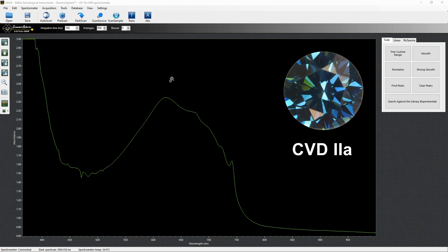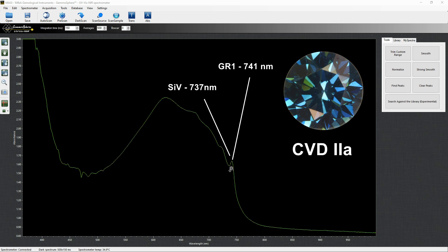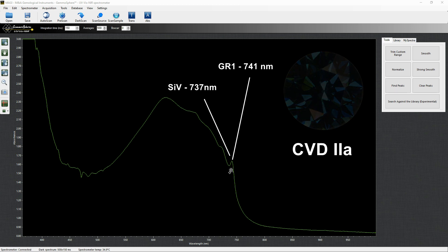CVD synthetic blue are typically type IIa treated by irradiation. A good indicator of the CVD method is the presence of the silicon vacancy defect at 737 nm along with the GR1 at 741 nm. Due to their vicinity though, those peaks can be individually detected almost only in liquid nitrogen immersion.